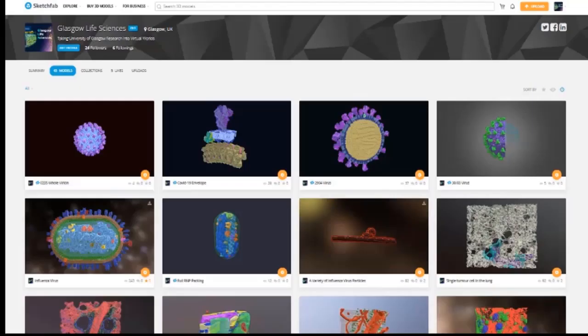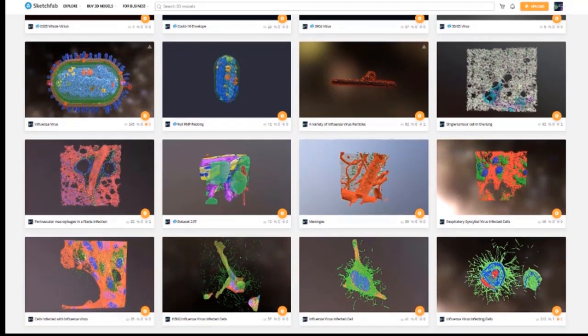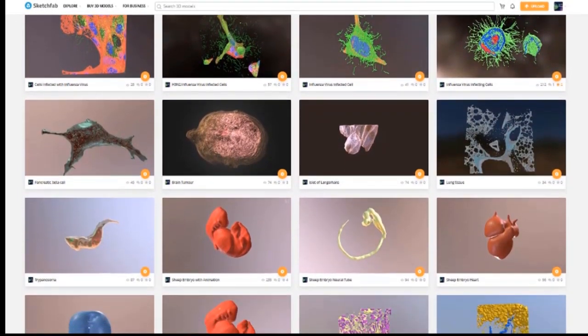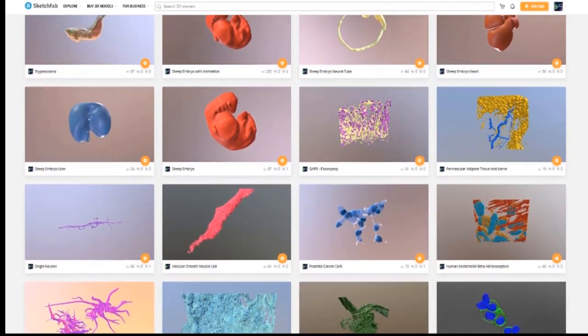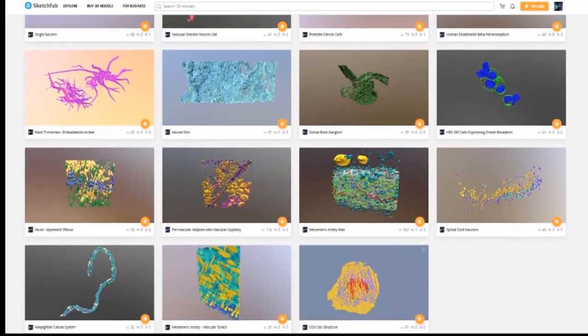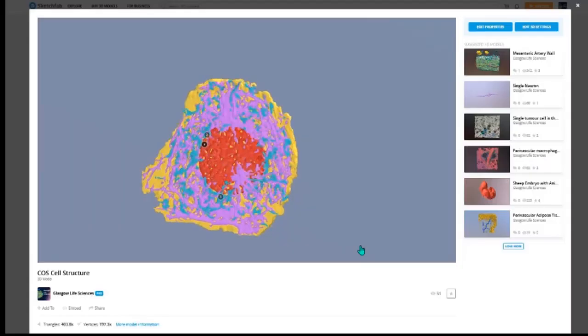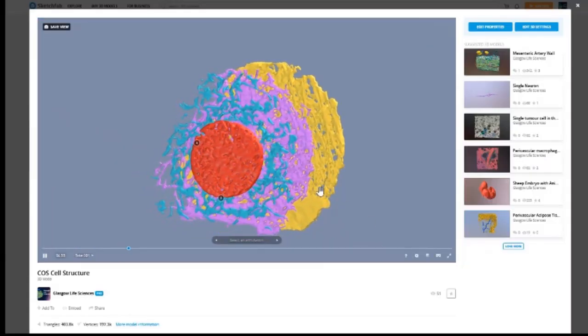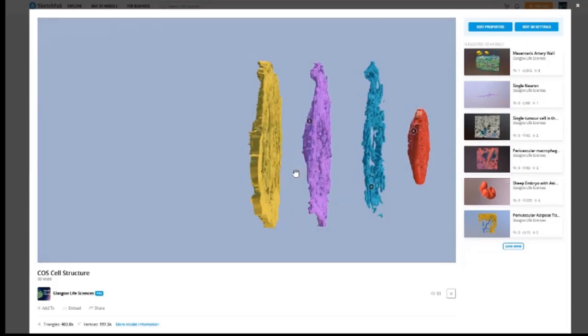Here we are in the Glasgow Life Sciences Sketchfab page. This is a collection of data that's been provided by researchers in the College of Veterinary and Life Sciences at University of Glasgow. Some of the data has been modeled in 3D animation packages, but most of it's captured using image scanning devices of one type or another. Here's that COS cell. It's been exported from 3D Slicer, trimmed in MeshLab, and then uploaded to Sketchfab, which is a fantastic way of making the 3D data available on a variety of web-enabled devices.